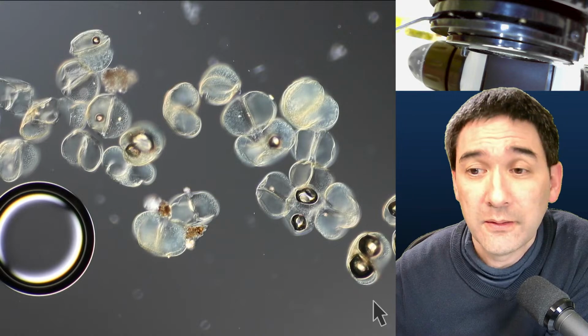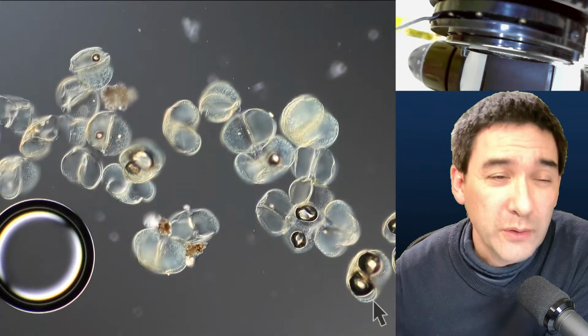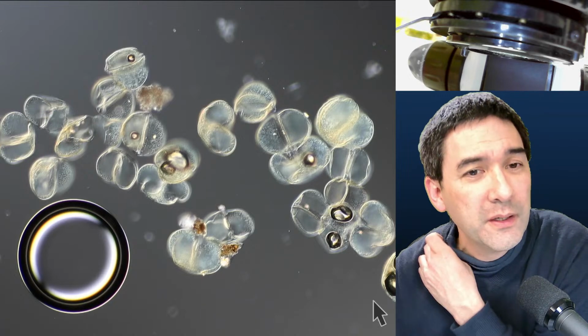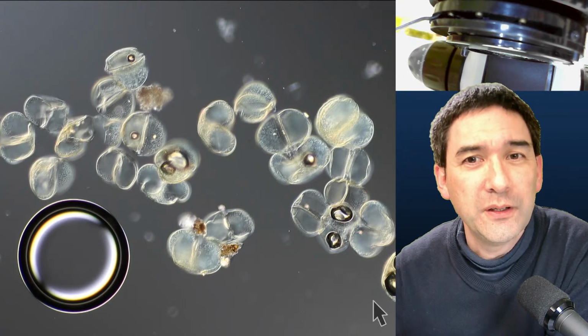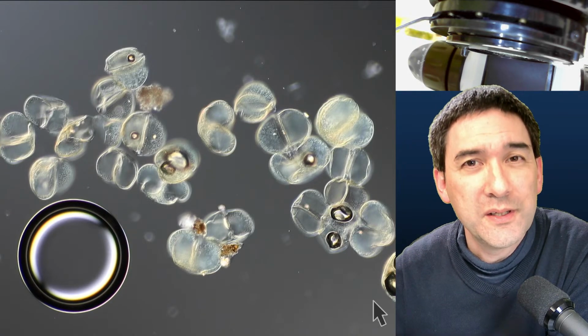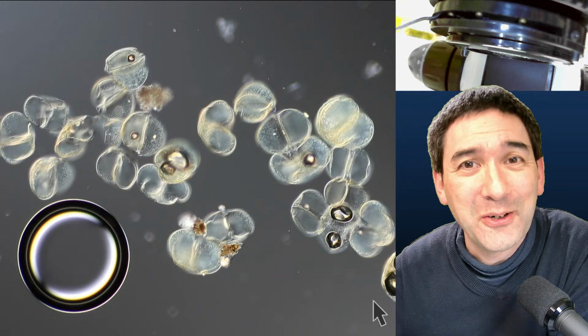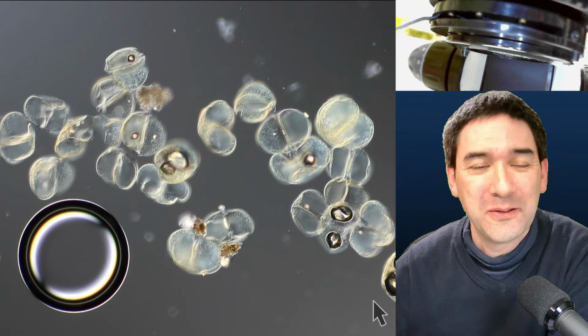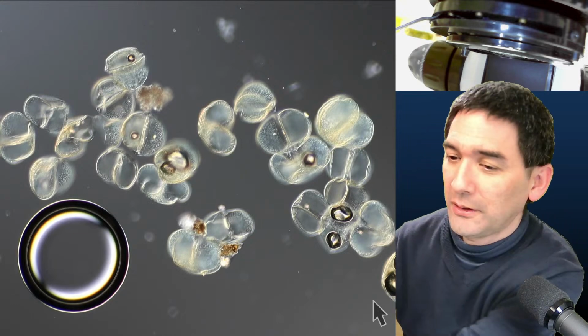So overall, what I would say is that it's maybe a good idea to have different mounting media around, so that you can always trial and error, because not every specimen is suitable with every mounting medium. Okay, so that was now Euparal mounting medium.